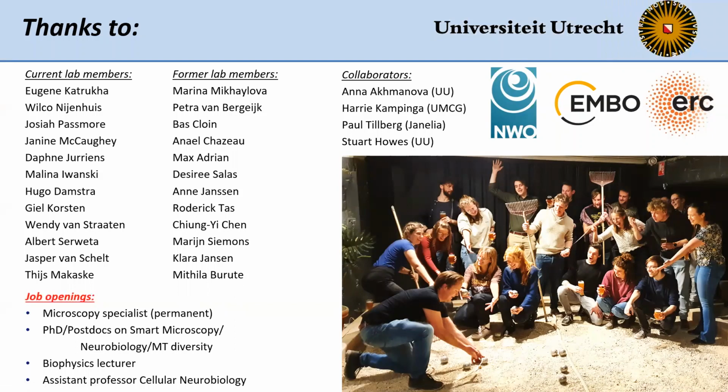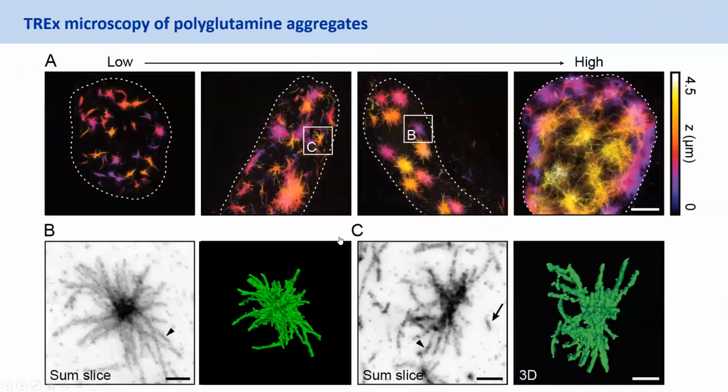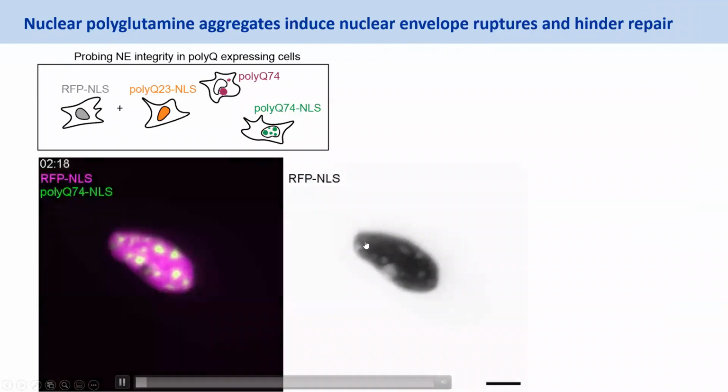Really thought-provoking. In the last couple of slides, you showed nuclear aggregates forming or perforating the nuclear lamina. I just wondered whether you'd had an opportunity to image that dynamically. I'm interested in the actual mechanism of perforation, or whether it's actually a disassembly of the lamina or incorporation of the lamina proteins in the aggregates. Do you have any idea about how that actually occurs?